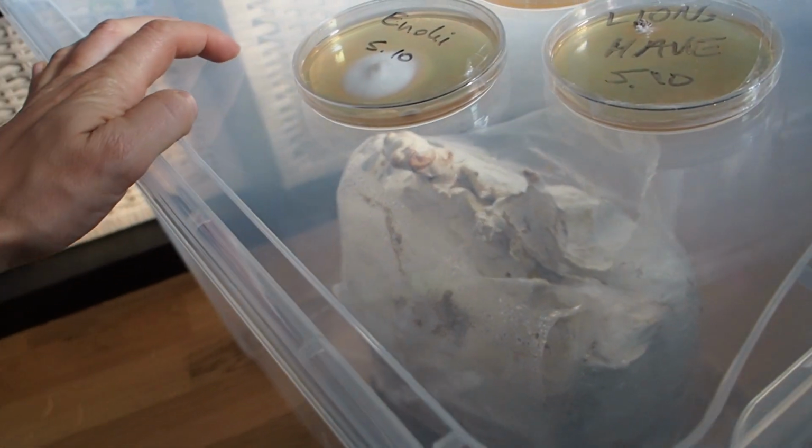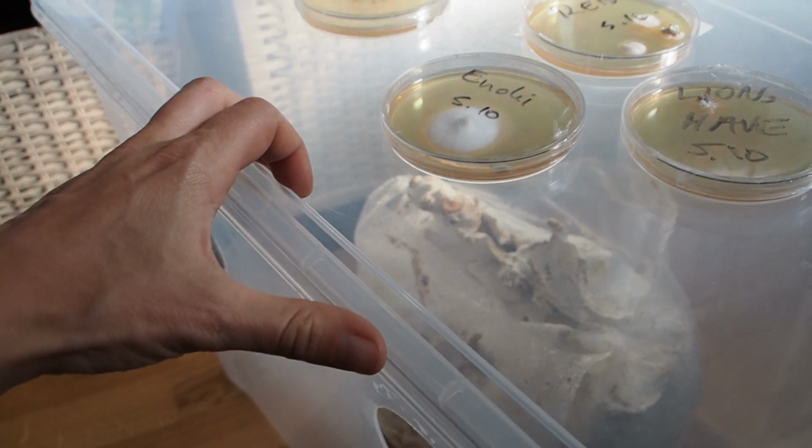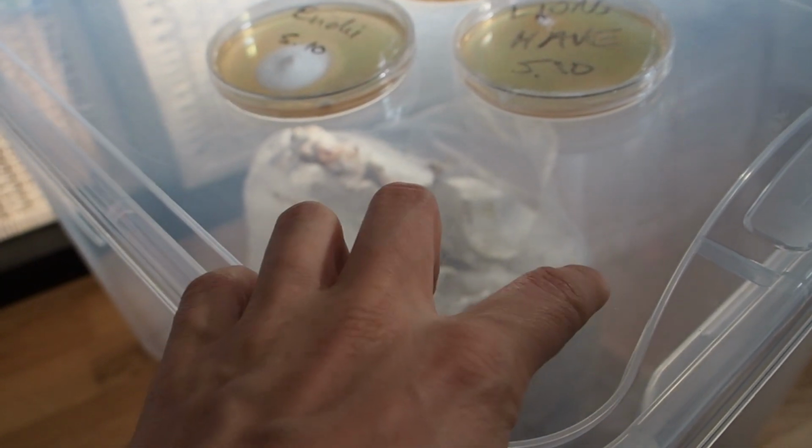So in general, the still air box is working, but I think you still have a small rate of contamination. So in future, I'm definitely going to make my cultures in a laminar flow hood.